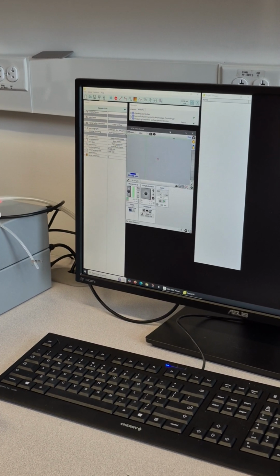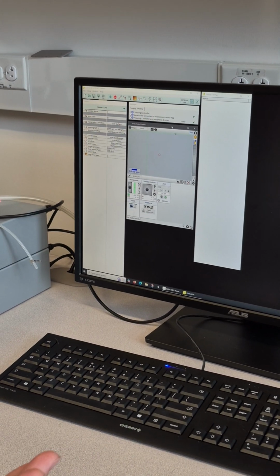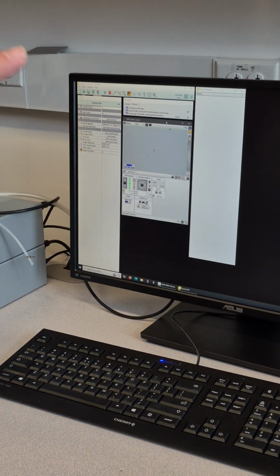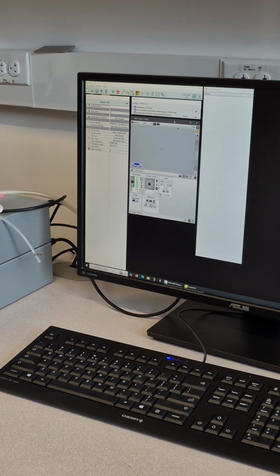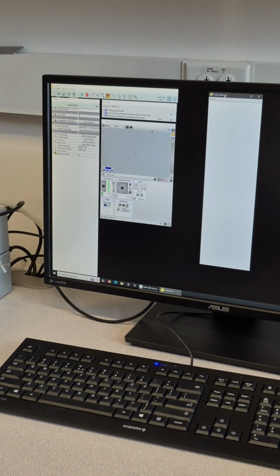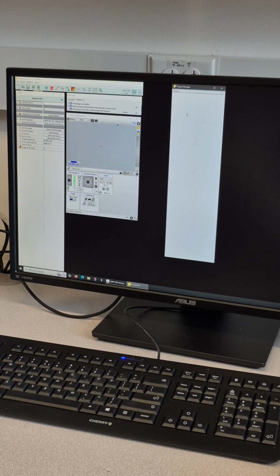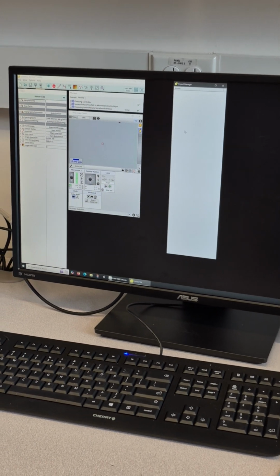And the video control, because this is a microscope, so you have the option of taking an image, and then on the image you can select a different place to collect Raman. Or you can collect a 2D area Raman. Every pixel it will collect a Raman. And this project manager, this is project 6. Every data you collected will be listed from top to bottom. Over here, you just double click and you can look at the data.